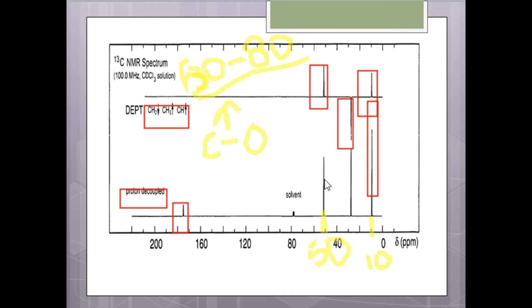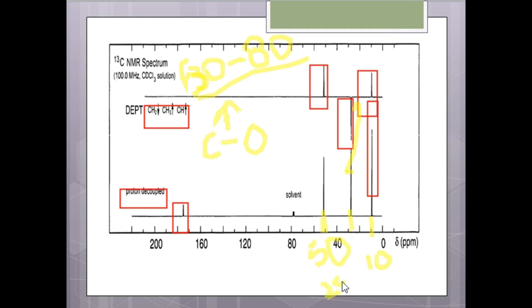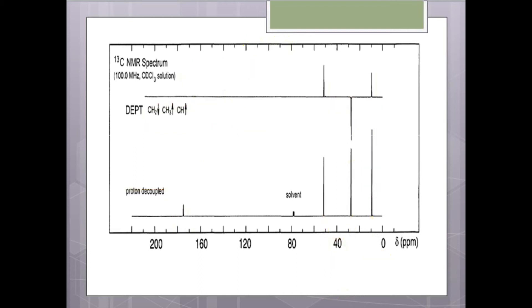The next peak area is due to the methylene group, showing a peak value at about 29 ppm.